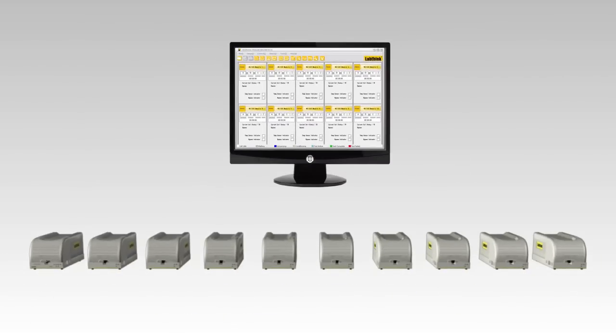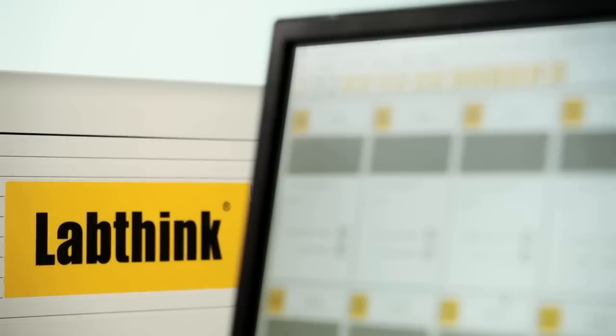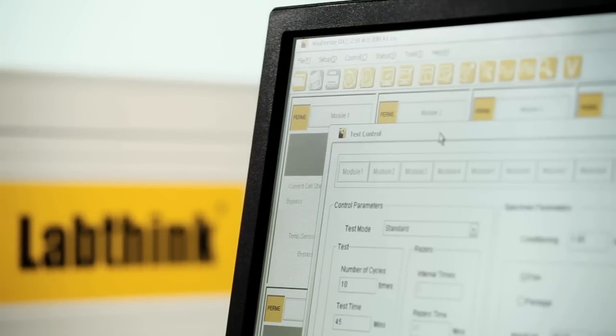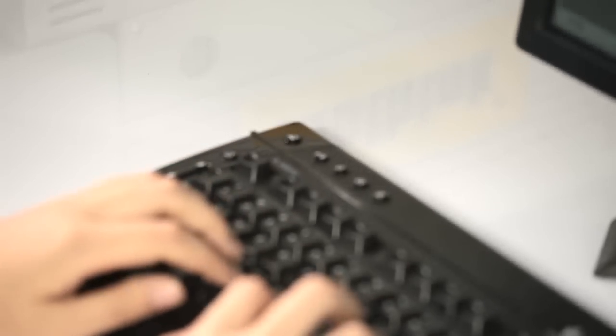It provides research institutions and manufacturers with an excellent solution for conducting multiple sample testing and significantly reduces the parameter setting time and test duration.